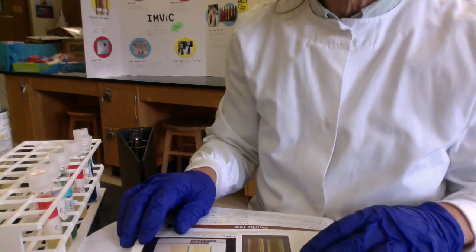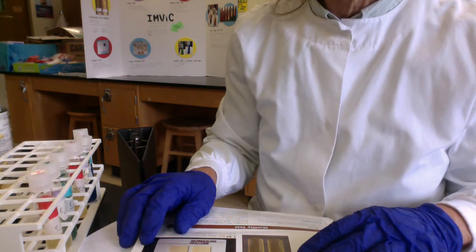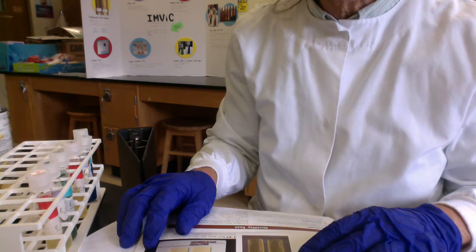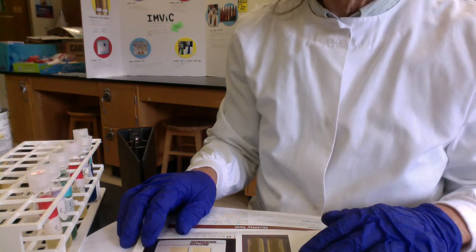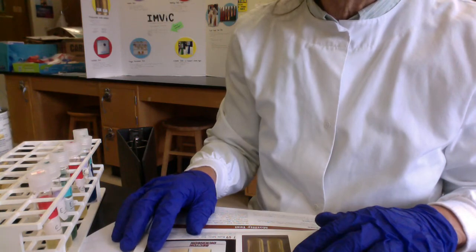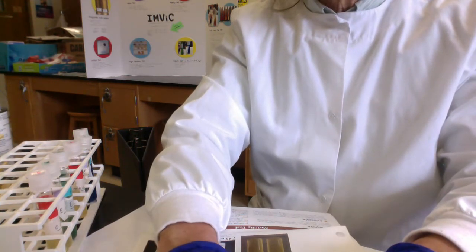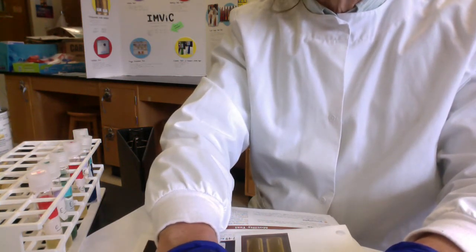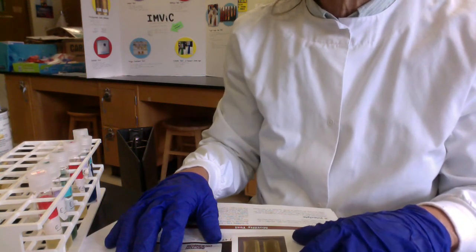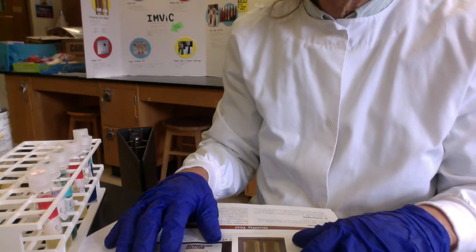The IMViC tests is a series of 4 tests: the indol test, methyl red test, Proskauer's test, and citrate test, that lets us distinguish E. coli, which is an indicator of fecal contamination of food or water, from its close cousin, Enterobacter aerogenes. Okay, so if we find high levels of E. coli in food or drinking water, we're really worried about fecal contamination.